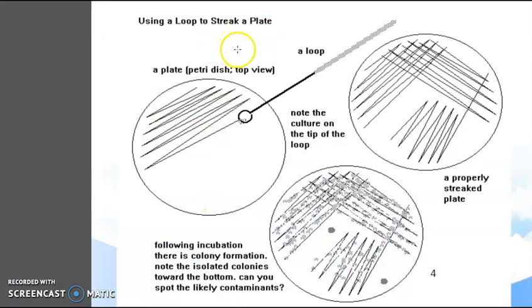You can see how a streak plate is done here. You have to take a petri plate and then a loop. It can be a nichrome resistance wire, and one loopful of the specimen is transferred onto the surface of a dried plate, and it is distributed thinly over the plate by streaking it with the loop in a series of parallel lines. Then different segments of the plate can be streaked similarly, and in between, the loop should be flamed and cooled between the different sets of streaks.